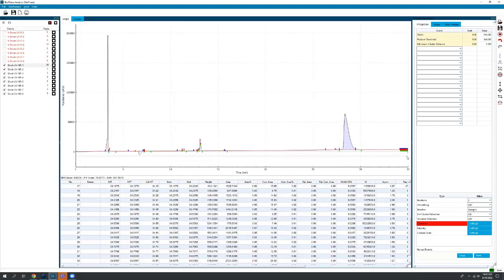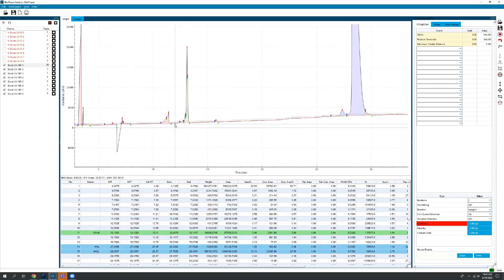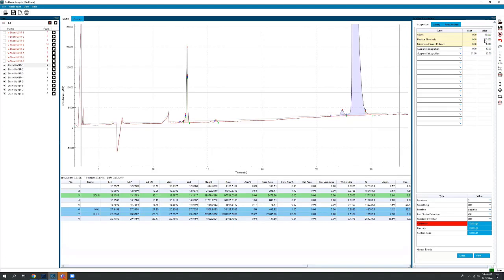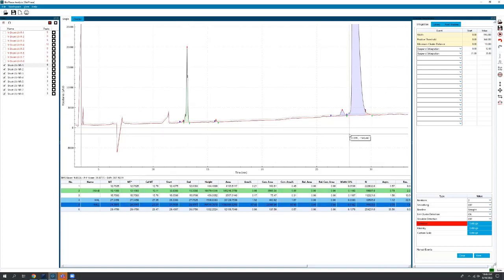All right, so here you can see what it thought of everything. Again, it integrates a lot of the system peaks, the buffer peaks. So we're going to start with suspending that integration from, say, 0 to 12 minutes, and then from, say, 31 minutes out. Now we can change some of the other parameters. I set the end of the peak at about 200, which is usually where I put it. Positive threshold looks pretty good. We're picking up some of the peaks there. Cluster distance, maybe we want that a little bit wider. See if we can. Oh, that helped us get our 10 kilodalton marker all together.